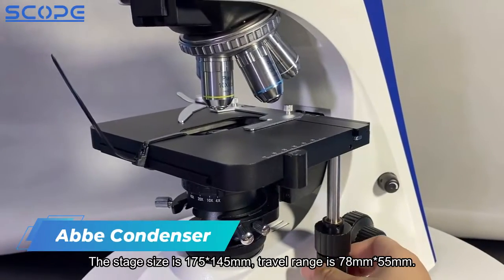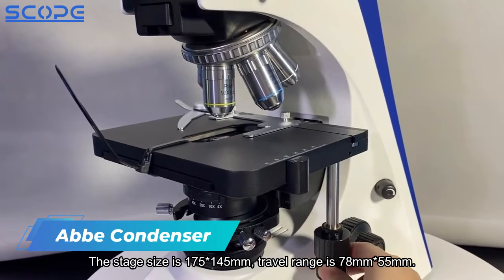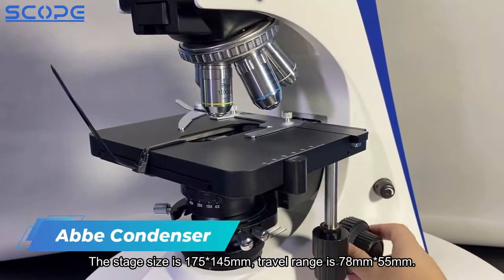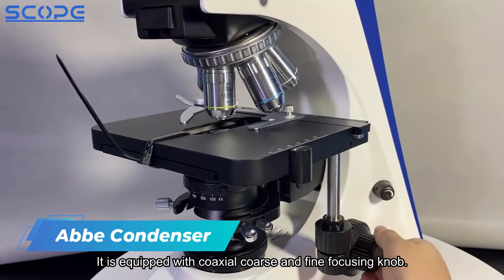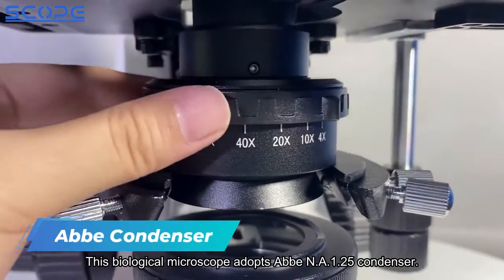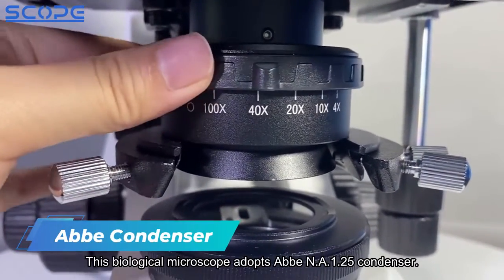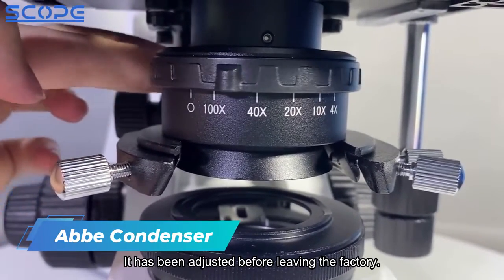The stage size is 175 × 145mm. Travel range is 78mm × 55mm. It is equipped with coaxial coarse and fine focusing knob. This biological microscope adopts an Abbey NA 1.25 condenser, which has been adjusted before leaving the factory.